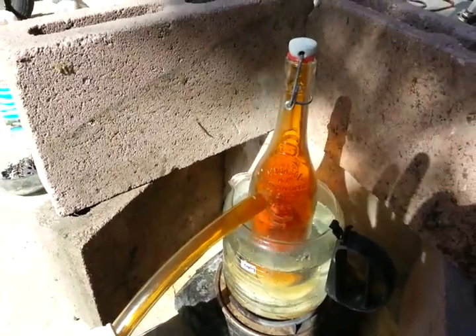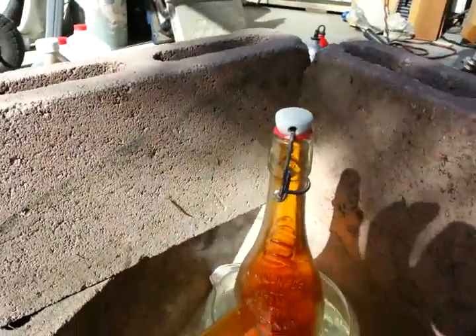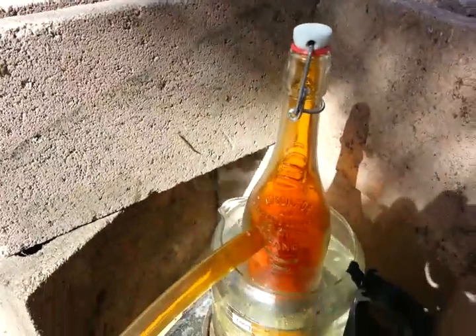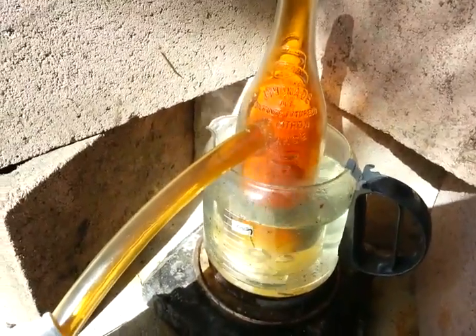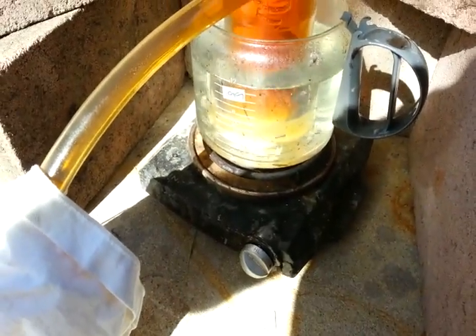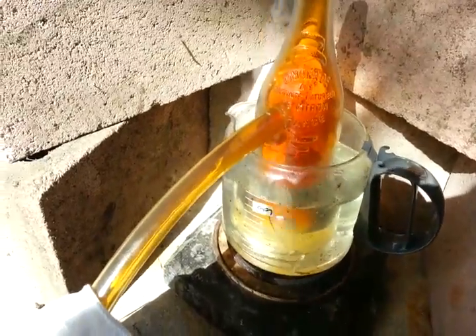Hope it helps you, gives you an idea. It was just a regular barrel that caps off, like a vinegar barrel or something. And just get a cheapo heater for the outside. And that's it.